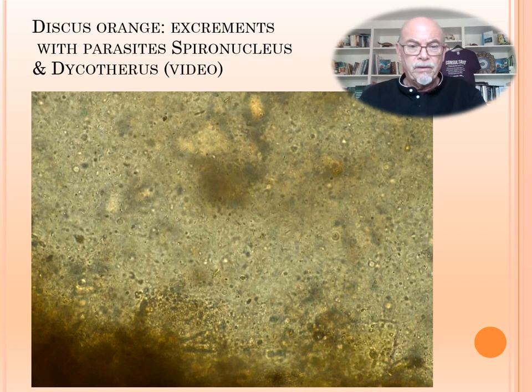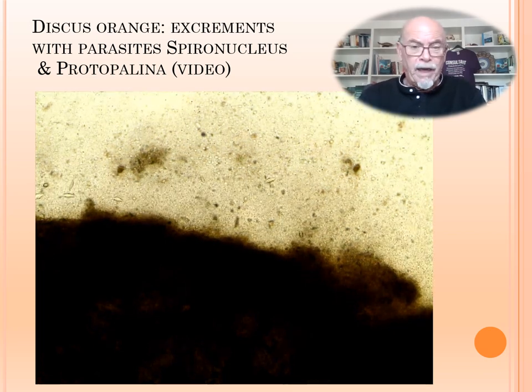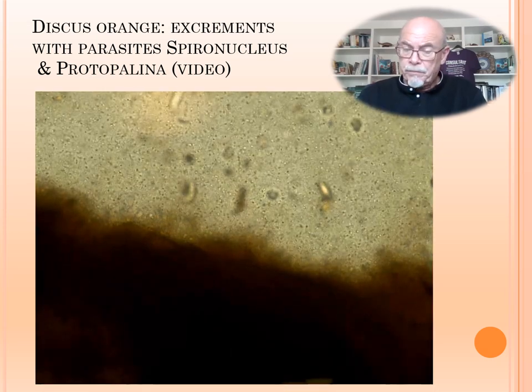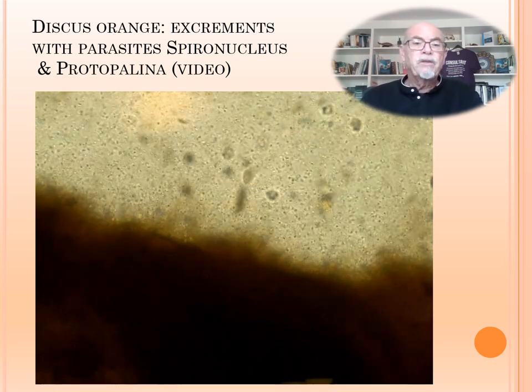They are a little bit bright and moving quite fast. Here we also see spironucleus together with protopalina in another part of the excrements at the blocked passage. So we've seen three different parasites. This is the protopalina — the much longer elongated ciliated parasite — which we found internally.